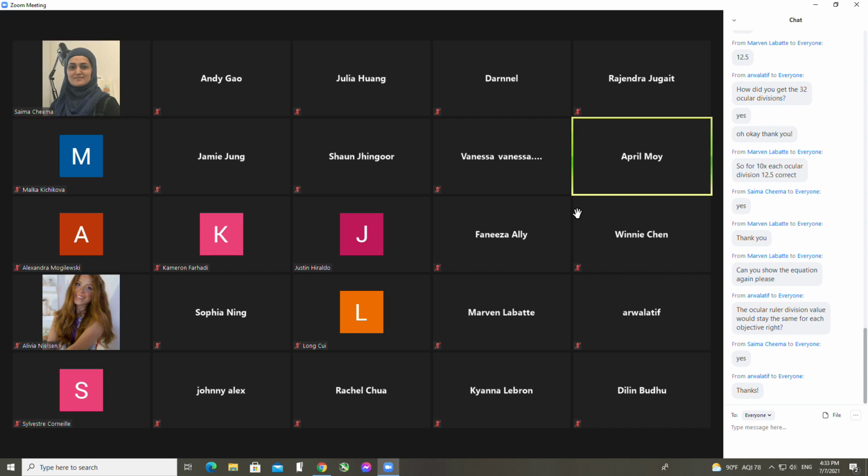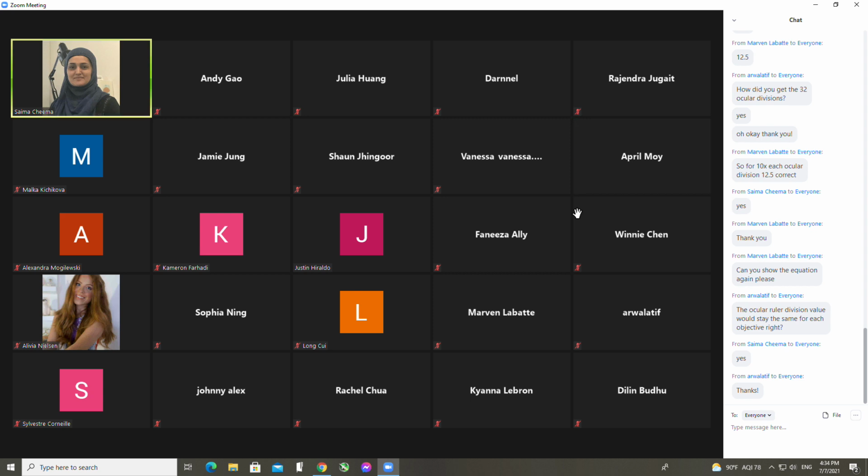All right, thank you. Another issue I had was with the green algae. As I zoomed in, it was harder and harder to make sure that I was measuring the same thing. Yeah, the other thing you can do is maybe measure half and then see if you can multiply that. If you don't think you can do it, because you don't know if you're seeing half or not, you can always say that you can't measure it.